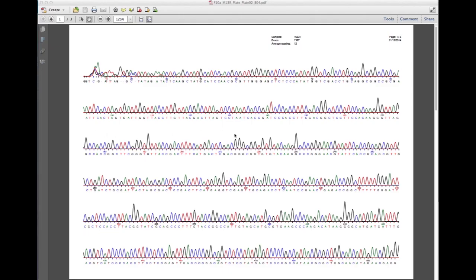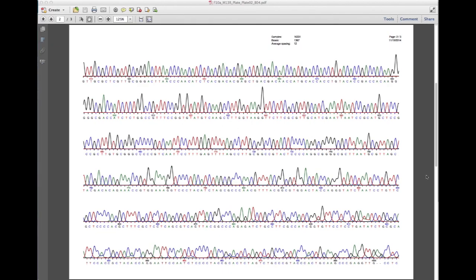As you can see, the majority of the run has high and distinct peaks on the chromatogram, indicating that this portion of the sequence is reliable. We can read the DNA sequence from these sections. I can see peaks marked A, C, G, and T, each with its own color.